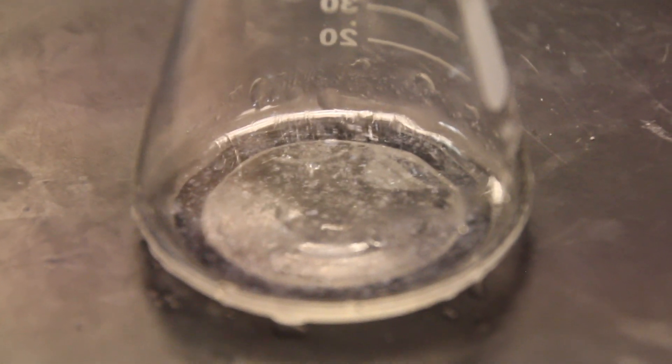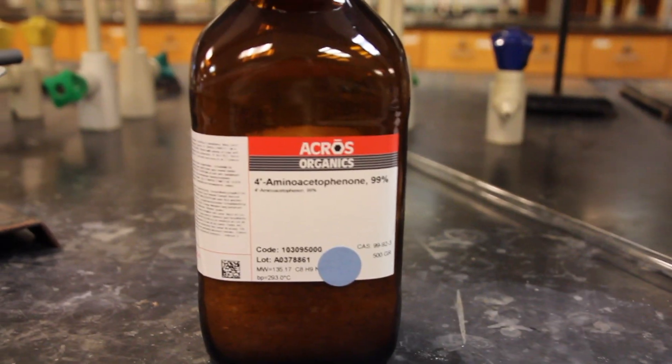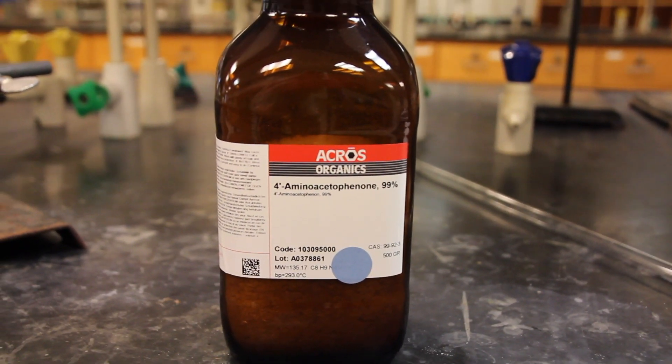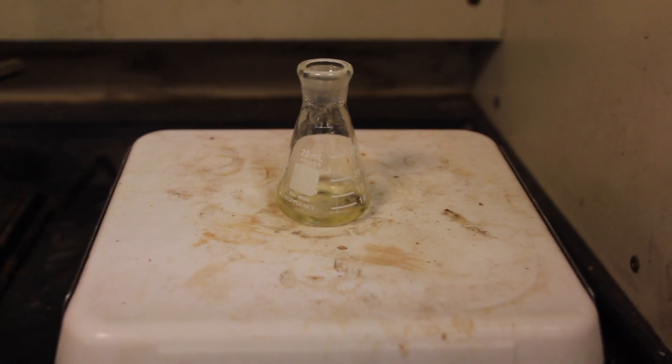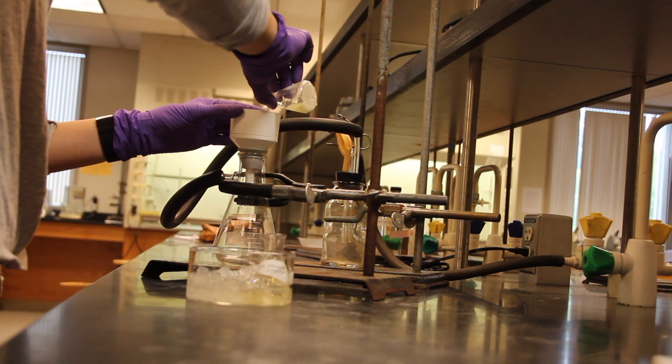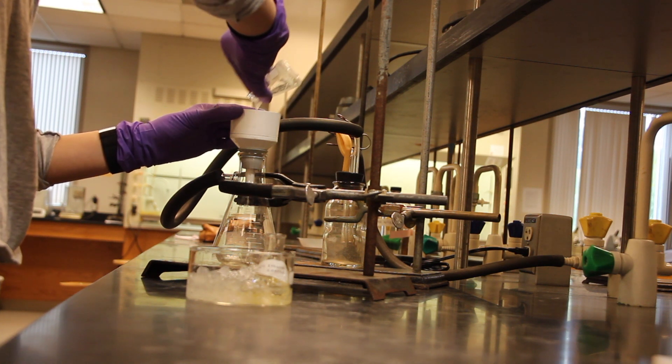In the next step, you're going to start over. Recrystallize a fresh 0.5-gram amount of 4-aminoacetophenone in the determined solvent. Recall that the recrystallization should be done near the boiling point of the solvent, and use either a sand bath or a hot plate to heat your solvent as appropriate.